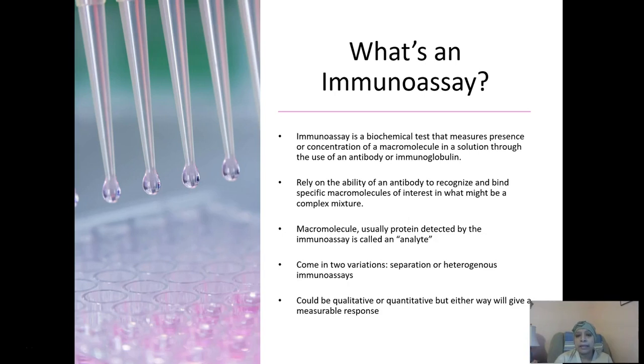For immunoassays, this macromolecule is usually a protein, and whatever we are detecting in an immunoassay is called an analyte. The macromolecule, that is, the protein itself.